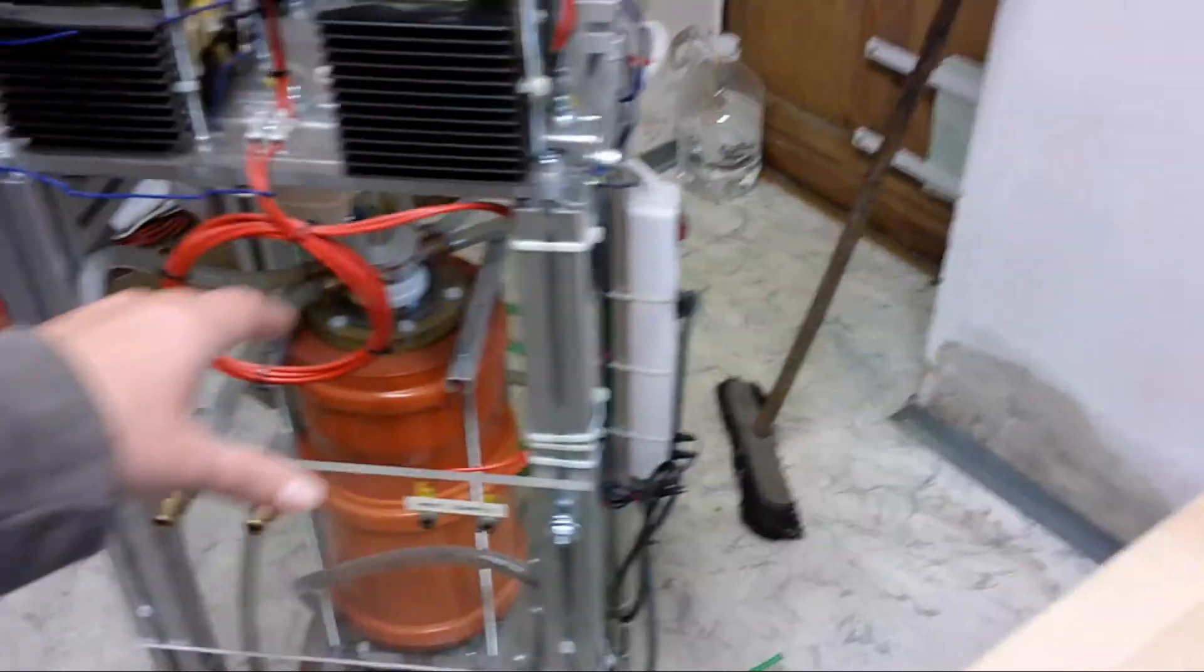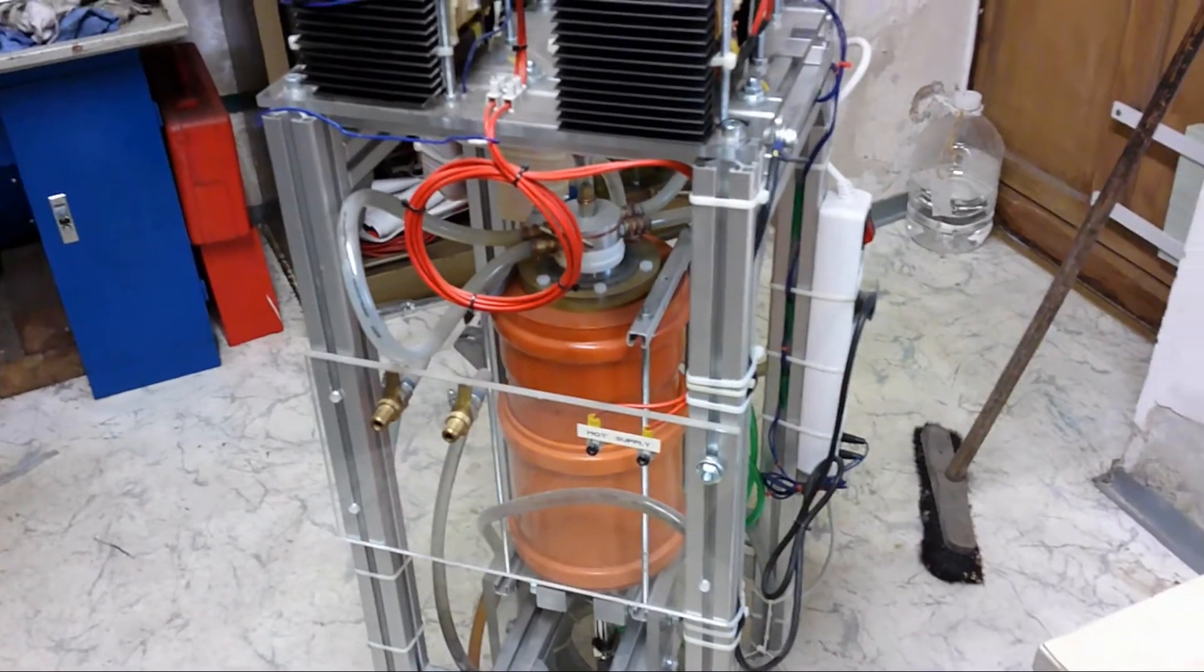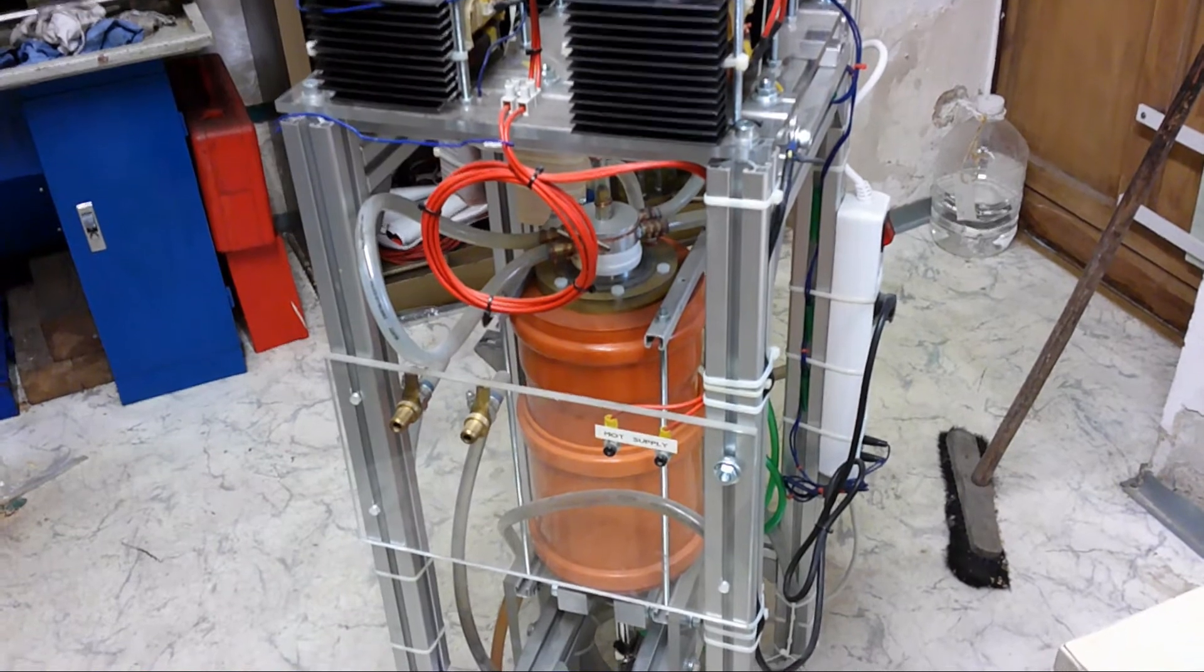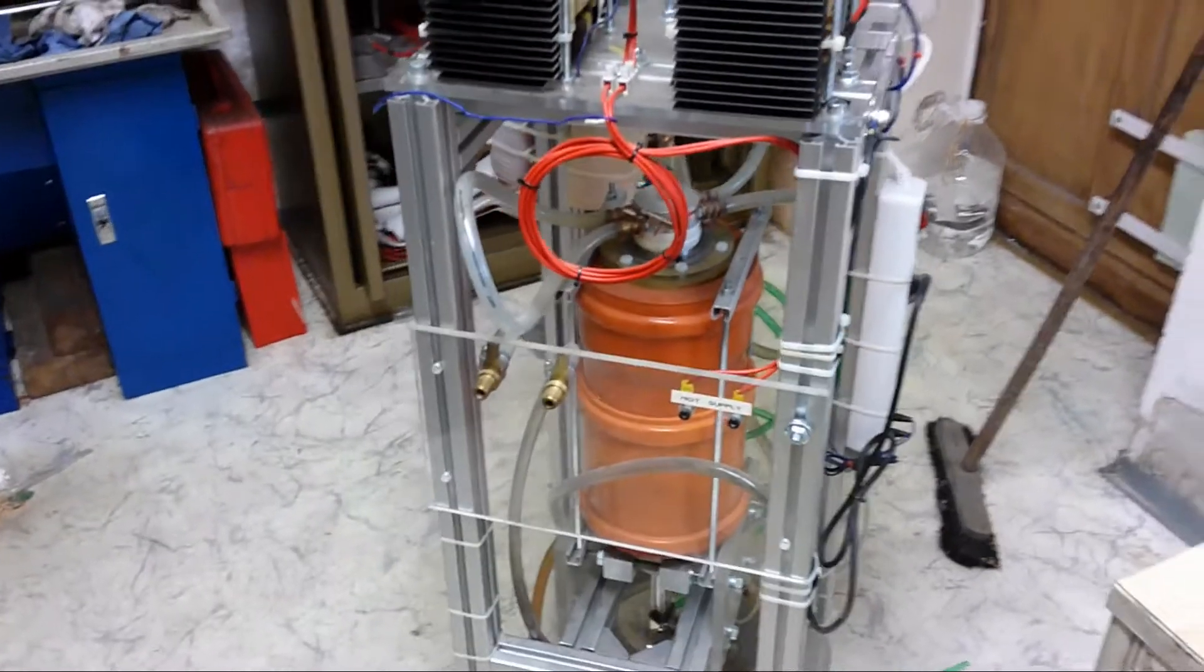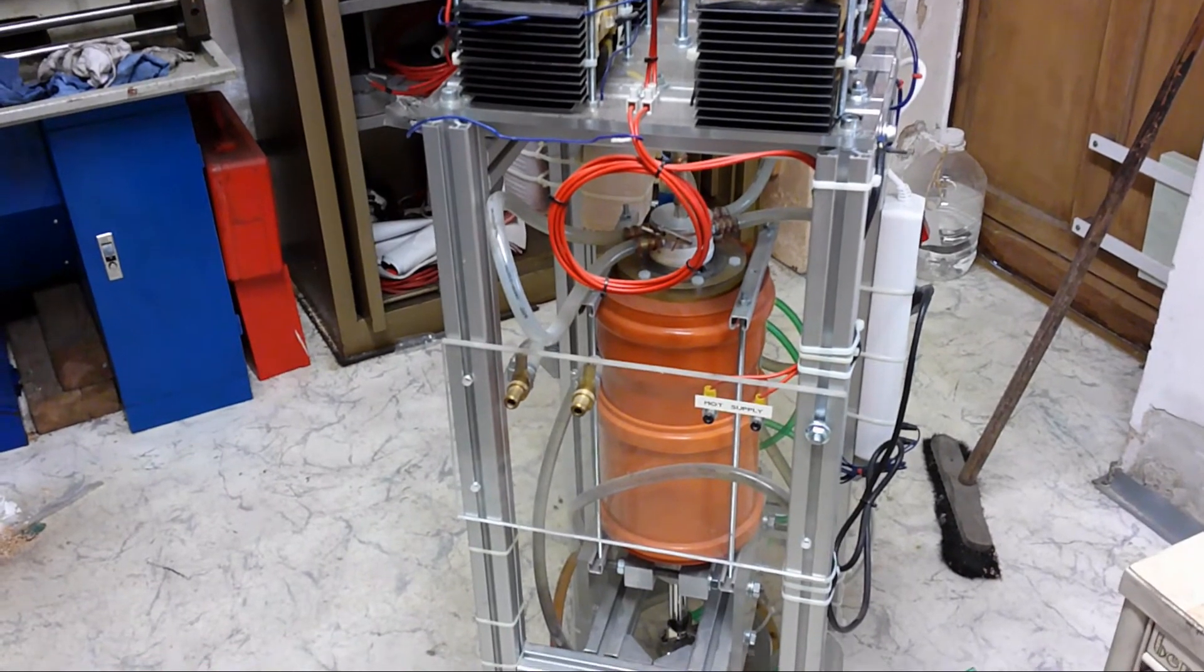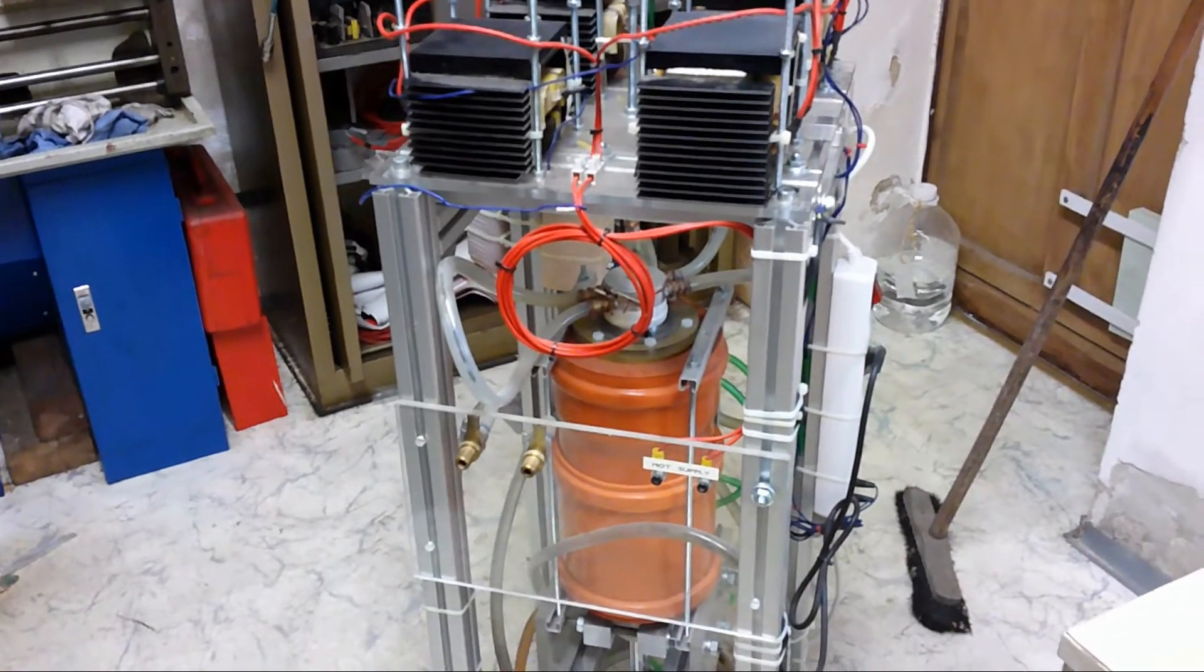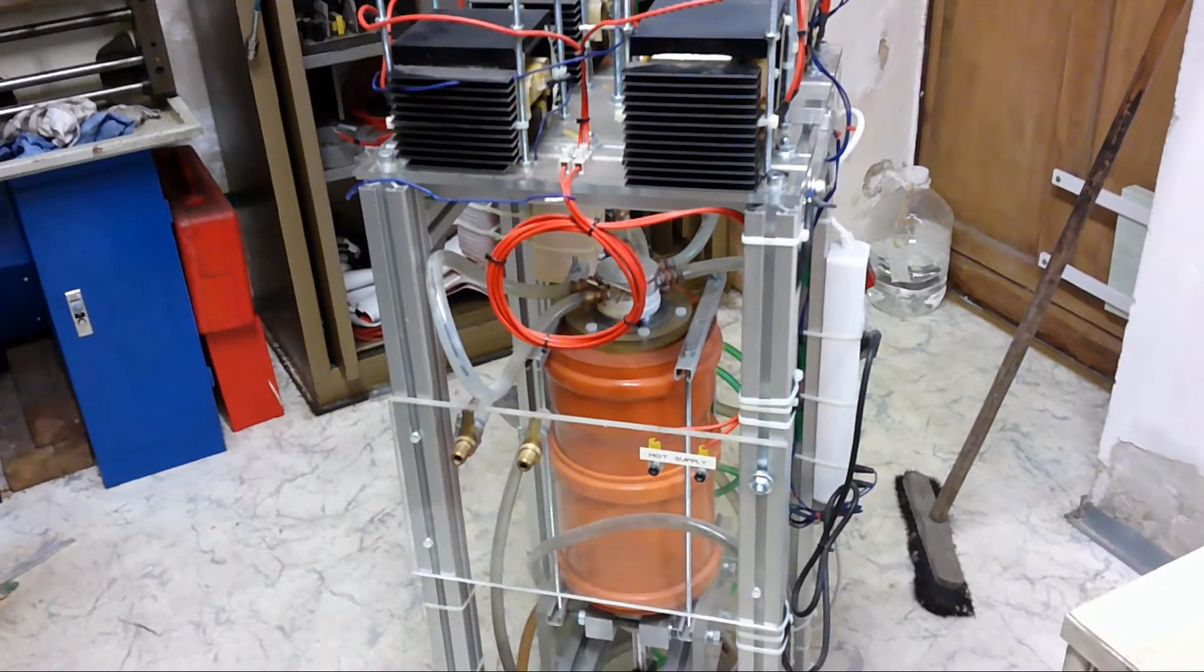But basically the main idea is that here in the plasma chamber, there is a very hot plasma burning generated through high voltage. Common air is blown through the plasma chamber, and the plasma does nothing else as it rips apart the nitrogen and oxygen atoms.